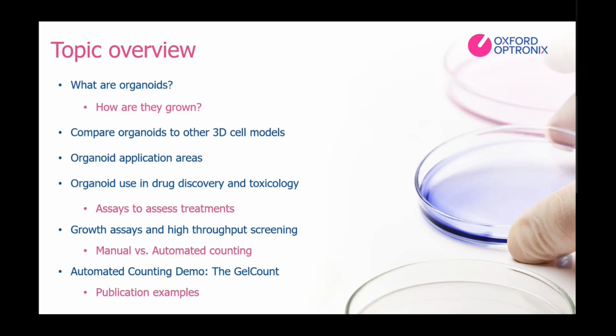Following that, we will look at how organoids are ultimately being used as models in current research, with the focus being on drug discovery and toxicology, including some of the numerous assays being done. That will take us into the back half of our discussion today, where we start to look at these growth assays, which seem to be one of the most utilized assays currently being used in drug discovery and toxicology with organoids.